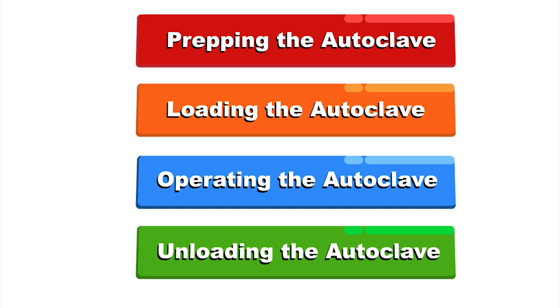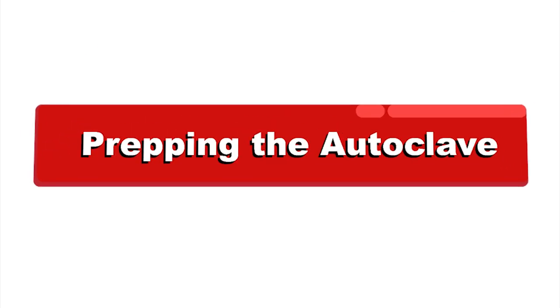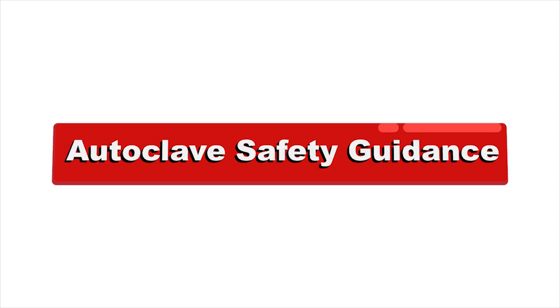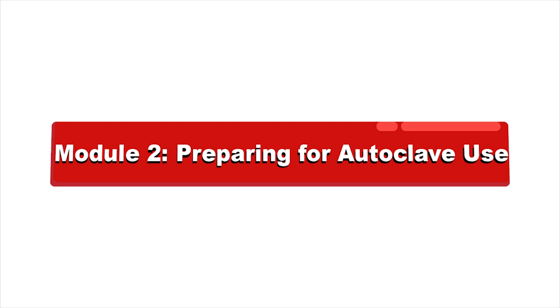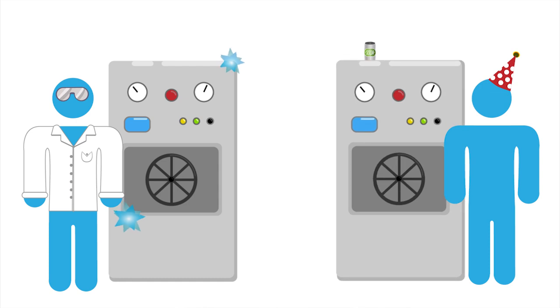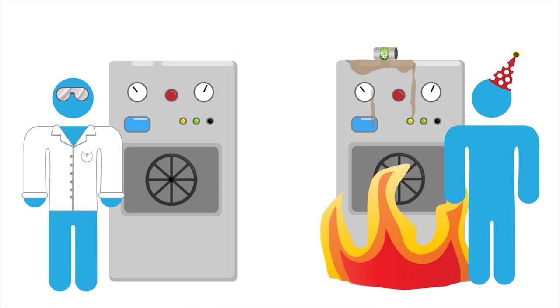Module 2, Preparing for Autoclave Use. As with all equipment, there is a good way and a bad way to use an autoclave. It is important to be mindful of the potential hazards along each step of the way. There are two steps one needs to follow to prepare using an autoclave. The first is to make sure the autoclave is in good working order. The second is to properly prepare materials for autoclaving.